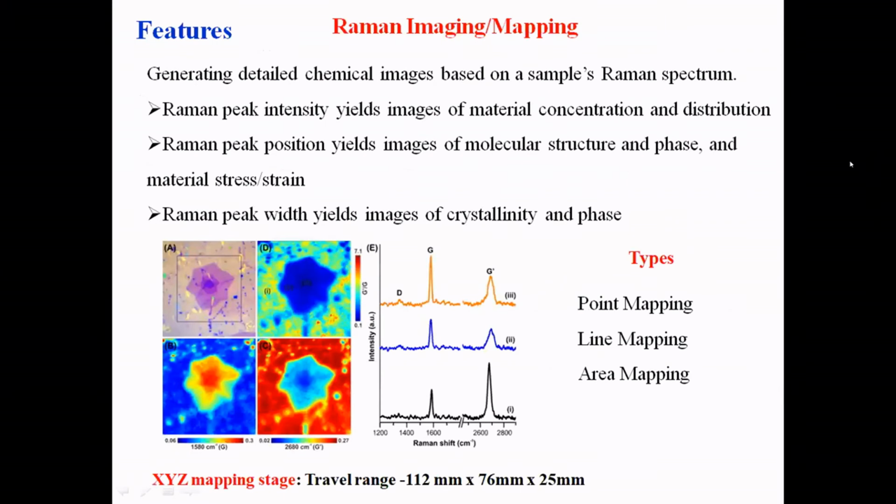And this is an additional feature covering the microscope part. As I told you, the microscope is not only for viewing the sample, you will get the image information as well. So if you have a sample and a microscope, you can see the surface at a particular length, and if you are interested, you can scan wherever you like.